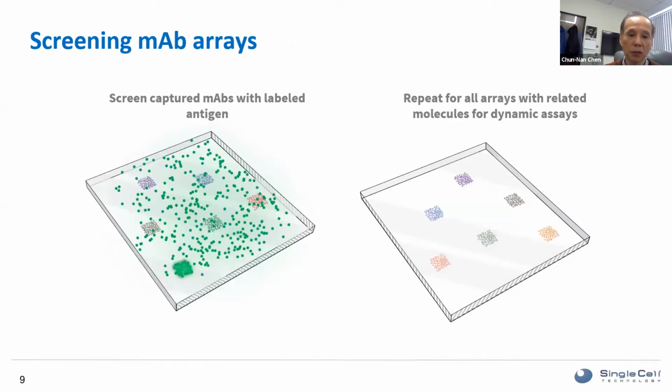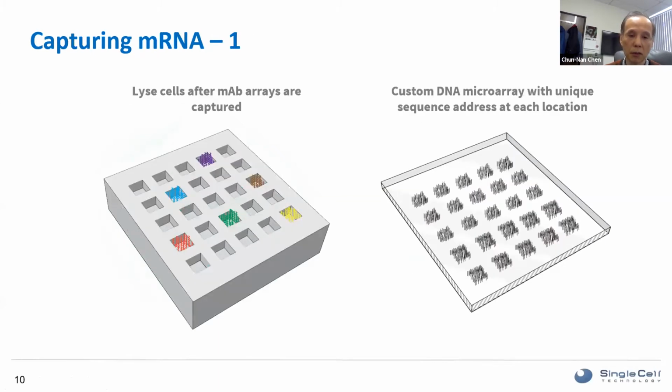And then obviously, once you have that, then you can actually flow the fluorescein labeled either antigen or any sort of screening molecule. So that will basically bind to the antibody of interest. And so you will identify that by scanning in the DNA microarray scanner. And you can do that for some other slides that you have done. So that's the second part, the antibody capture that I talked about earlier.